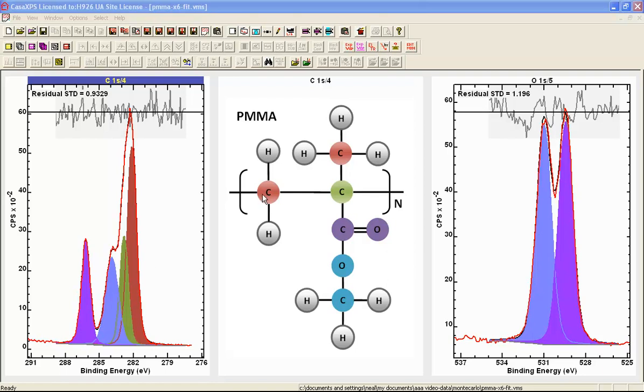So you can see that the hydrogen carbon bonded carbon, and here we see there are 2 of them, and so we have a peak that's twice the size of these other peaks, and that's because there are only 1 in each one of these chemical states, where we've got carbon that is bonded to carbon that's double bonded to oxygen, and this has produced a small shift. When we have carbon single bonded to oxygen and hydrogen, we produce a larger shift, but the largest shift occurs when we have carbon double bonded to oxygen and also single bonded to oxygen. So we have a significant shift here in this peak.